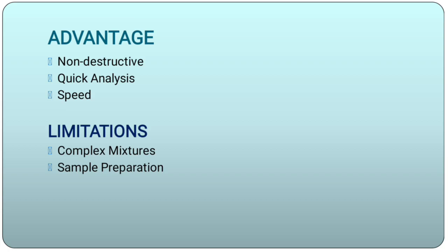Then we are going to see advantages of infrared spectroscopy. The first one is non-destructive. It requires minimal sample preparation and no destruction of the sample. And the second one is quick analysis, fast results and relatively straightforward interpretation.